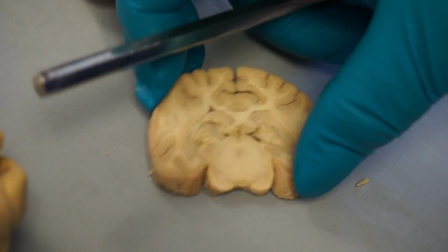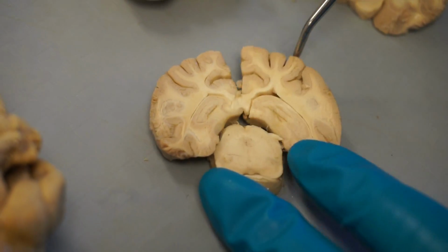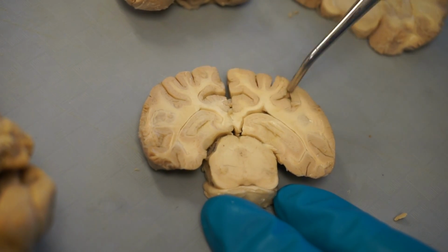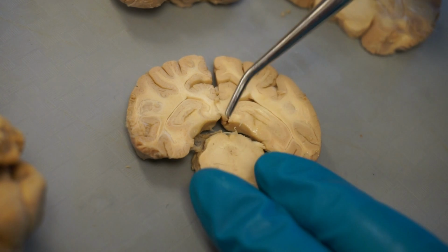The next section after that would look a lot like this, where we still have cortex out here, so we have telencephalon, but we've lost our geniculates, and so there's no more diencephalon.